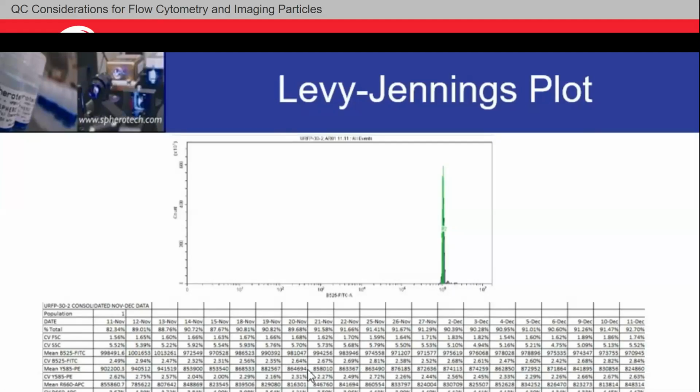Over time, you're going to have your own confidence parameters for those individual channels. What you see as a normal jump, what you see as abnormal, right? Kind of like if you have kids or family members, siblings, parents, some people's body temperature varies more than others, right? Some people tend to spike more than others. These are things that you'll know what your normal is versus another person's normal. Same with your instrument.